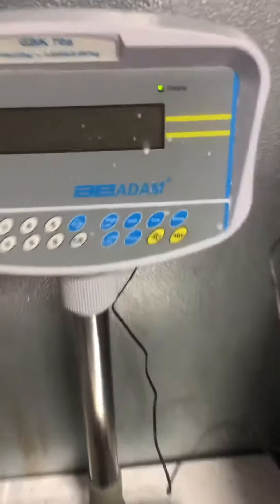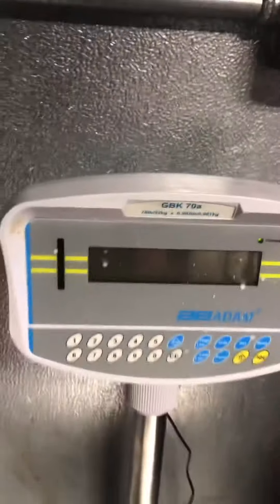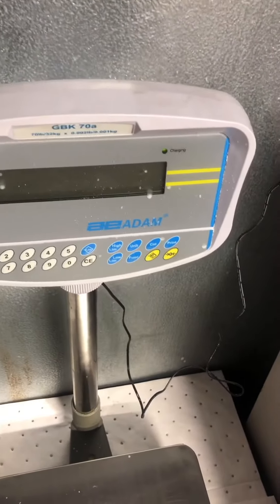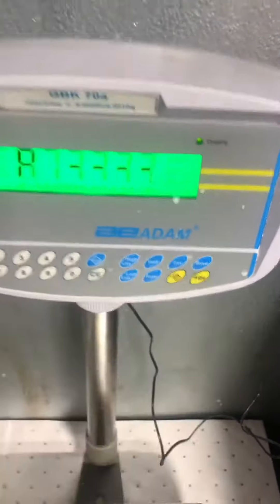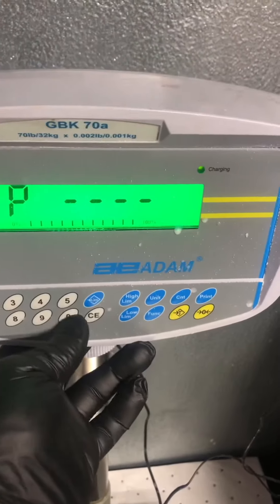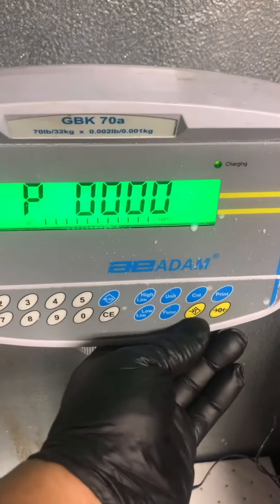So this is a calibration adjustment of an Adam GBK70 or 30 GBK, pretty much the same models. You would turn on the power and when it goes into the diagnostic countdown, press the tare once. It asks for a password and you put in four zeros and hit tare.